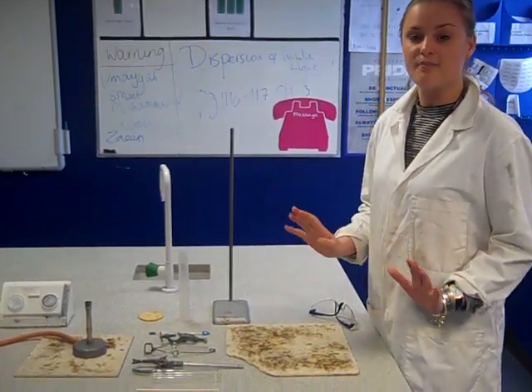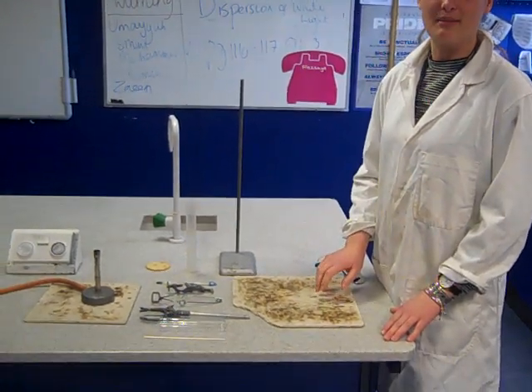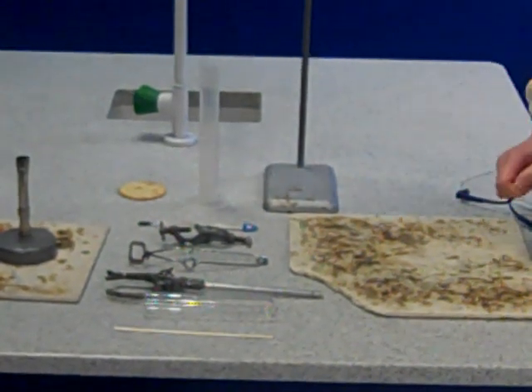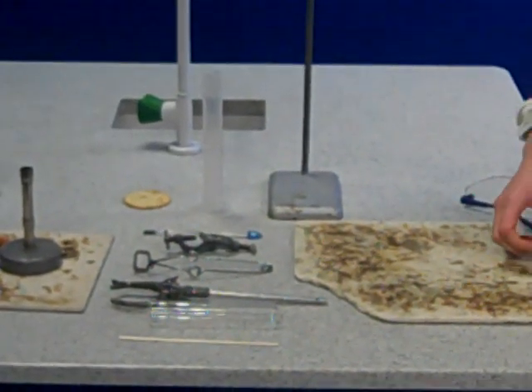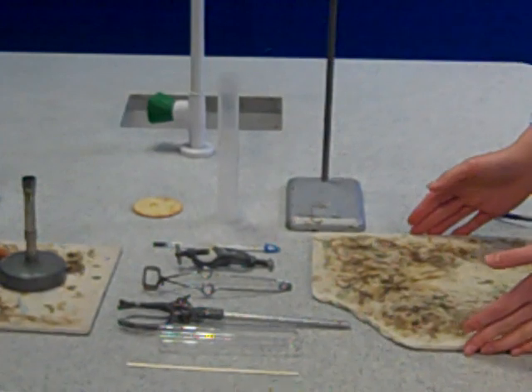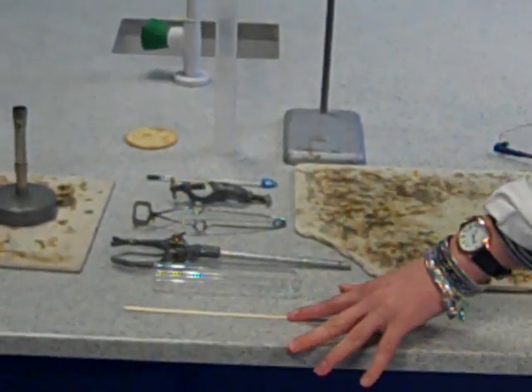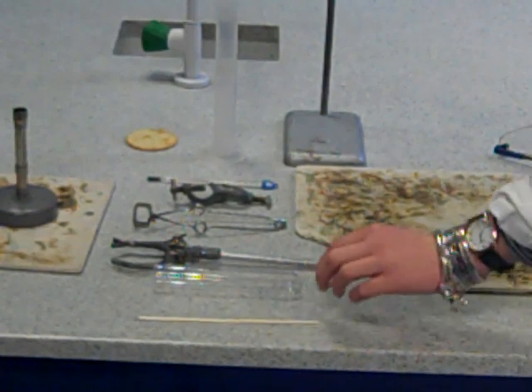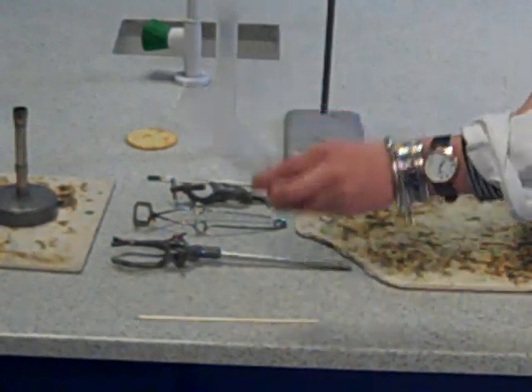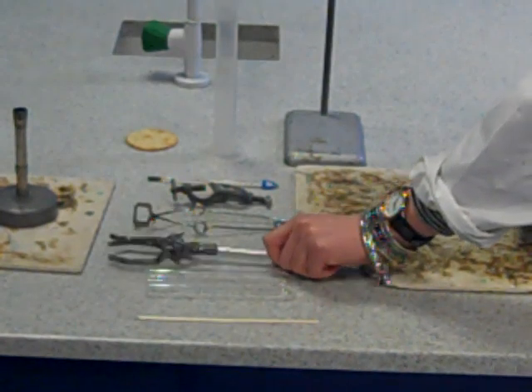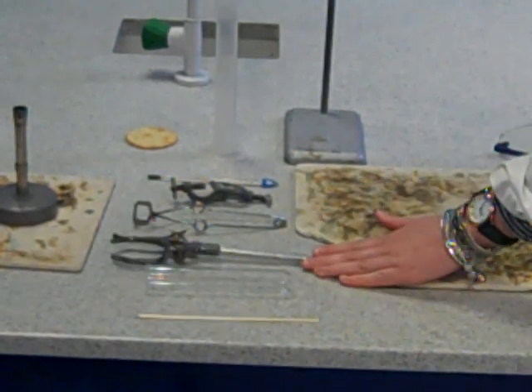I'm going to start off by showing you the equipment that we need to actually conduct this experiment. So firstly, you should have seen on your list the equipment that you've been asked to collect. It should look like what I have got in front of me. So I have a splint. This is used to light the Bunsen burner. I have a boiling tube. This is what I'm going to put the water in. This is called a clamp. I'll show you how to set those up in a second.